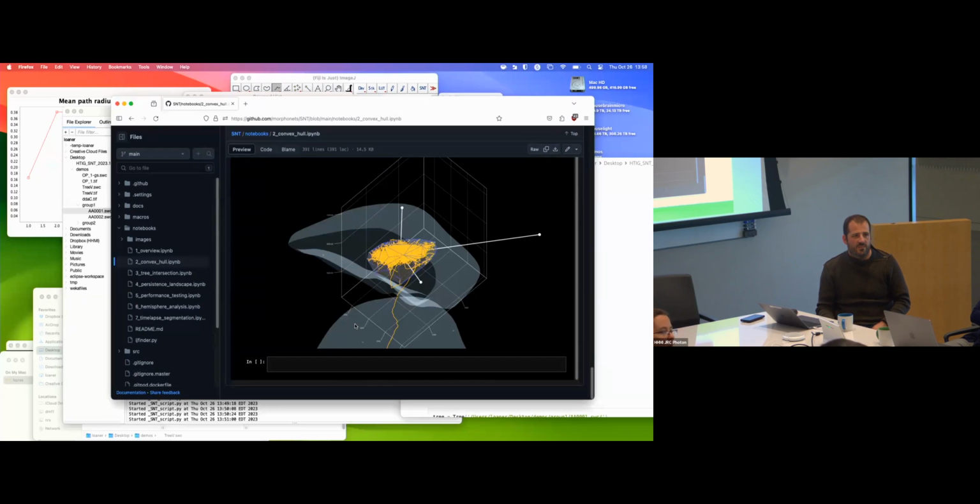No, I was just wondering because from the Python notebooks, you get Python code completion and stuff like this, but you don't see anything useful in the Java classes when you want to use PyImageJ to call anything directly. Yeah, that is true. I think people just use the examples that we have.